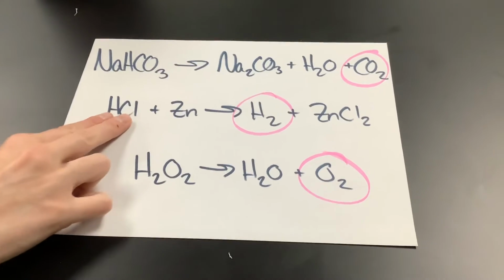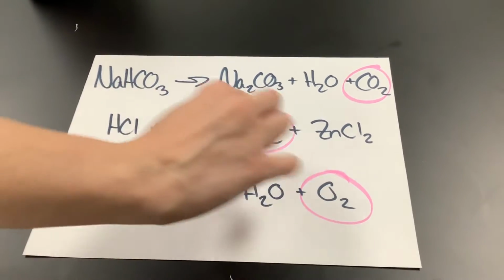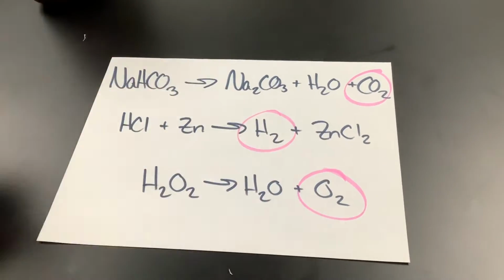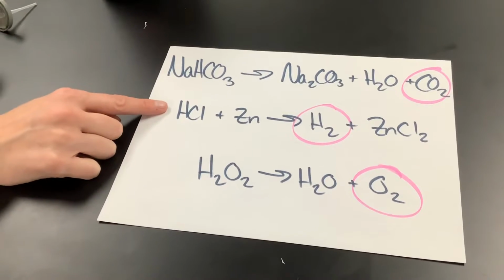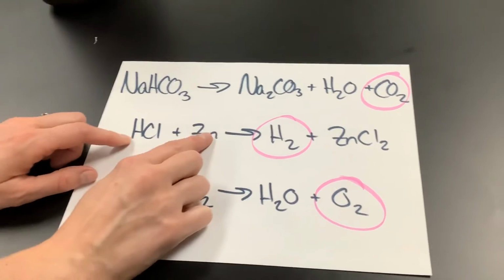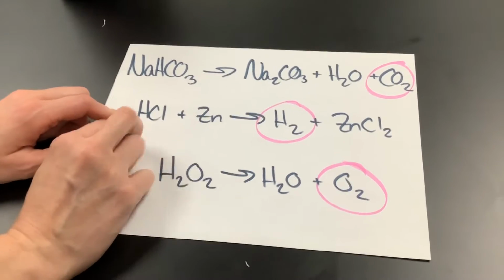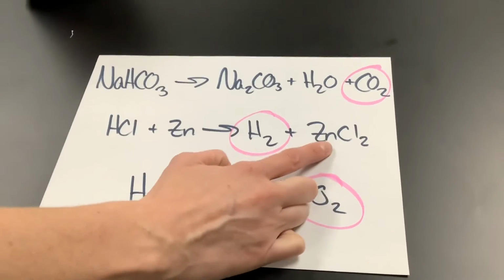We've got a pair right here, and then we've got a single. And what is that single doing here? Splitting. It's displacing it. So what kind of reaction type is this? Displacement. Single displacement, because we've got this pair right here, and then that zinc is coming in and displacing the hydrogen. It's just swapping partners right there. Well, just the one right there. So our product is gonna be hydrogen gas and zinc chloride.